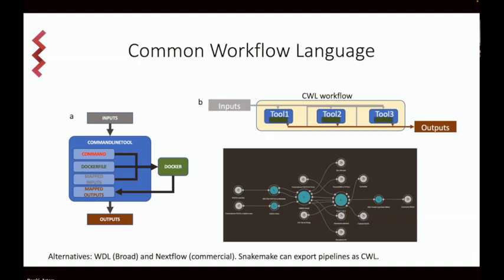There are alternative workflow languages. We are not using them currently, but some of you might. One is called Workflow Definition Language, which is used mostly by the Broad Institute. And there is another language called Nextflow, which is from a private company.